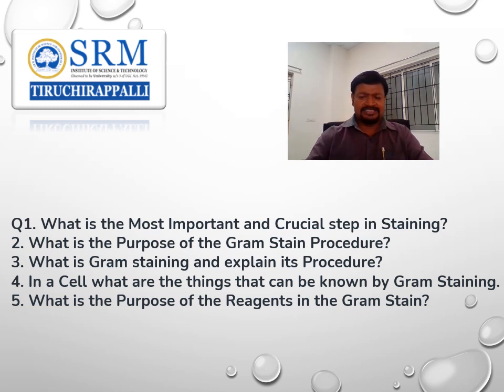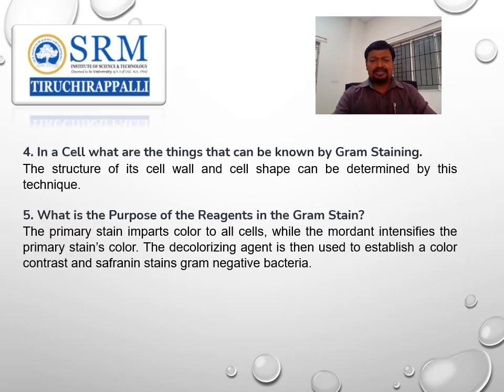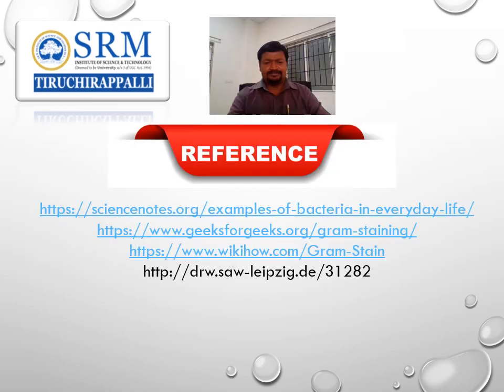Some questions: What is the most important or crucial step in staining? What is the purpose of the Gram staining procedure? What is staining, and explain the procedure? In a cell, what can be known by Gram staining? What is the purpose of the reagents of Gram staining?